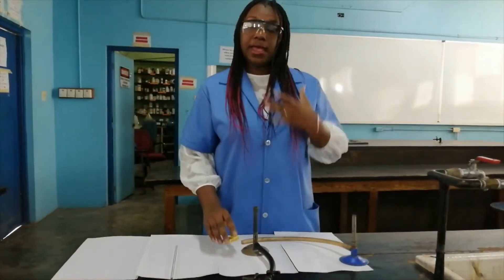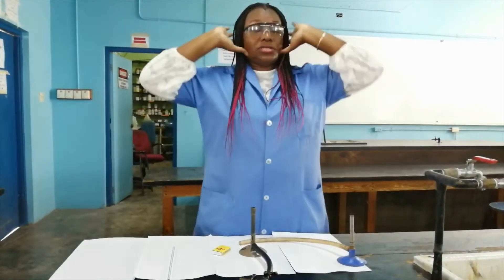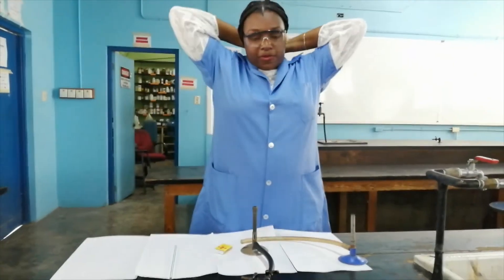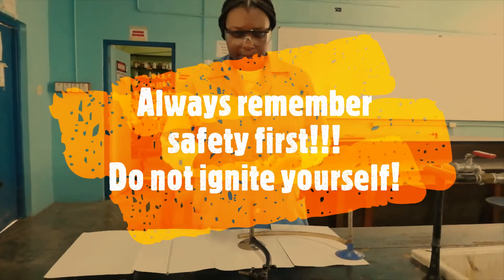Just before I light the Bunsen burner I do not want my braids to catch on fire, so of course I am going to keep it away from my face and the flame. If you have long hair, normally you are supposed to tie it back in the lab.